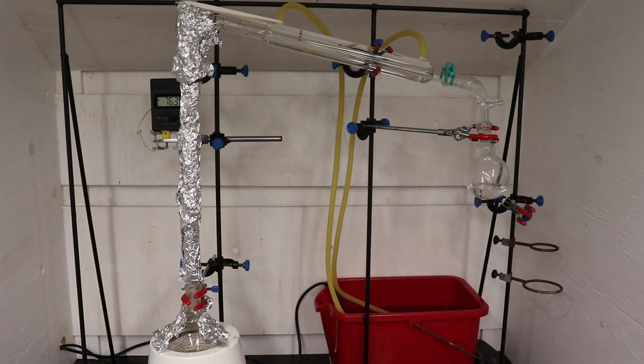To push over the last of the ethanol, I insulated the fractional column using aluminum foil. Shortly after, the rate of distillation slowed down, and the stillhead temperature began dropping.